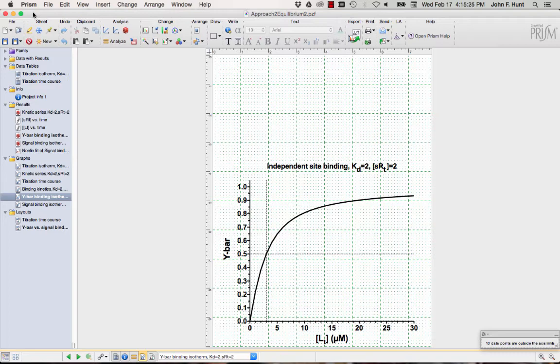The main purpose of the screencast again is to teach you a little bit more about using PRISM, but there's a moral to this story that is quite important, which is understanding the limitations in experimental data in terms of your ability to infer the underlying parameters, and the fact that noise has a strong influence on the quantitative accuracy of the parameters inferred from experiments.